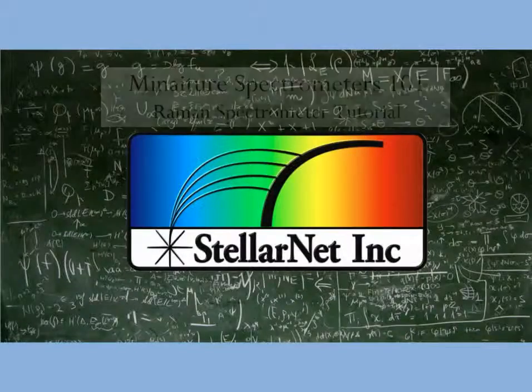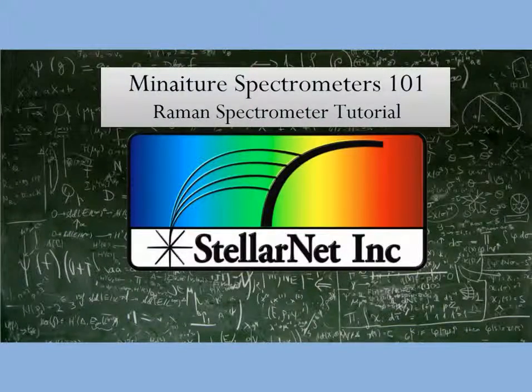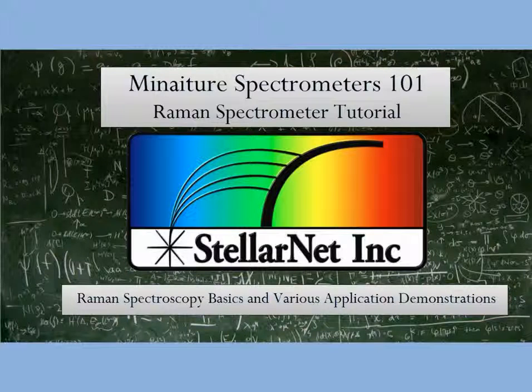Hi, and welcome to Miniature Spectrometers 101, the Raman spectrometer tutorial. Today we will be reviewing Raman spectroscopy basics and looking at various application demonstrations.